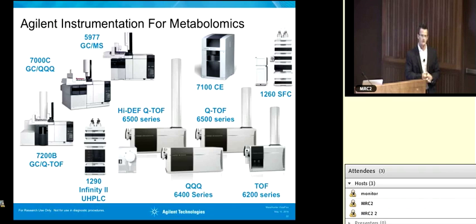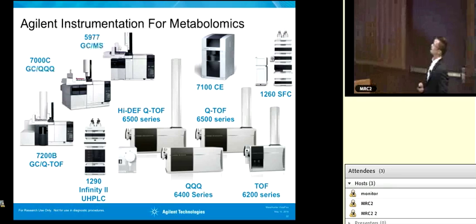So the benefits here are that we're extracting EICs instead of looking at the raw mass spec signal, and so we're not being confounded by noise and background, so that decreases our false positives and gives us basically more accurate results. So now I'll give you a real example, and as you can see, the data that we're seeing here is reasonably complex, and so at this point you might start to understand why we're not just jumping right into isotopomers and then targeted analysis.